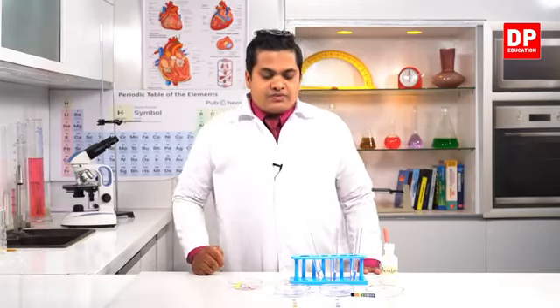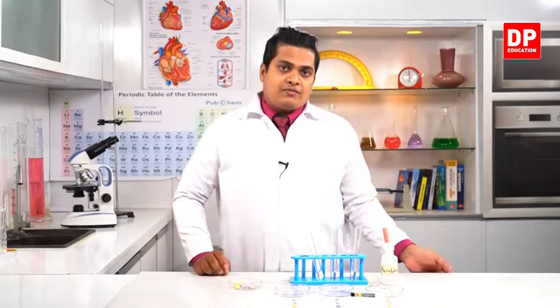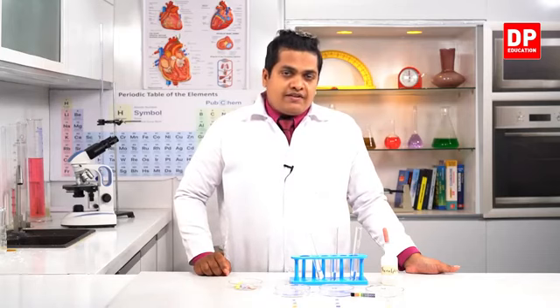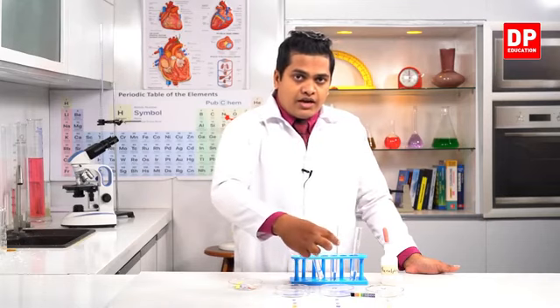So these are our observations from this experiment, right? When you add pH papers to acids, it's giving out a red related color. So the pH value of an acid is around 1, 2, 3 and 4.